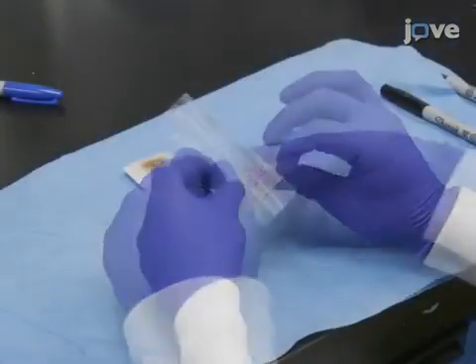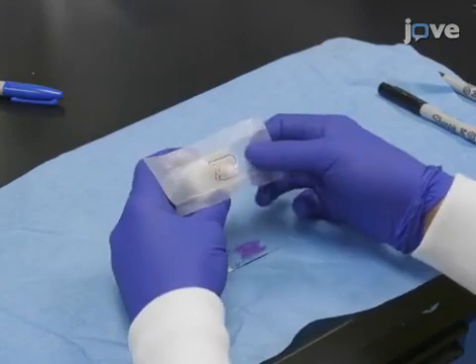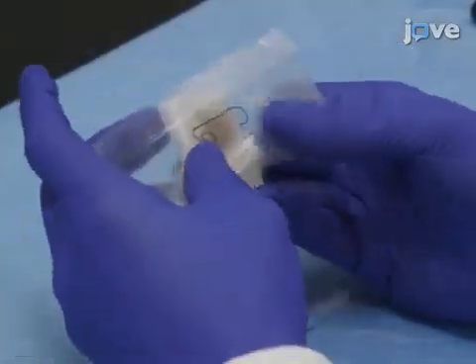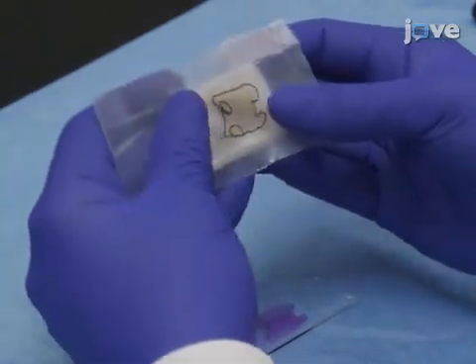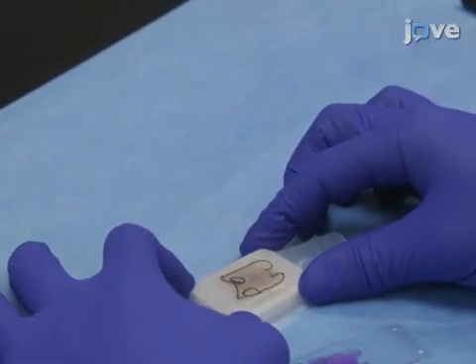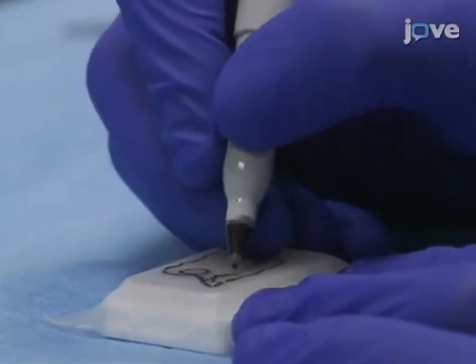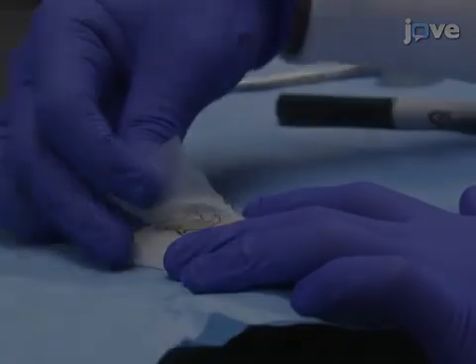Next, remove the film from the slide and transfer it to the corresponding tissue block. Orient the film by flipping or rotating it so that the outline of the entire tissue matches the observed shape of the tissue in the block. Press the section of film firmly to the surface of the block to prevent slippage. Using the tip of the permanent marker, make shallow but visible indentations along the outline of the region of interest, and then remove the film.